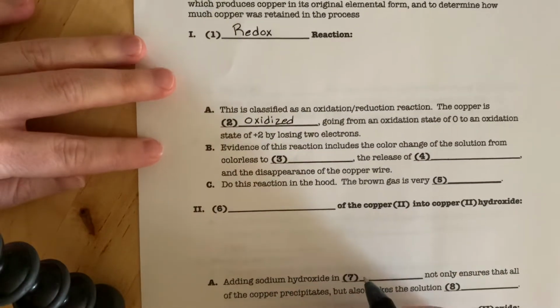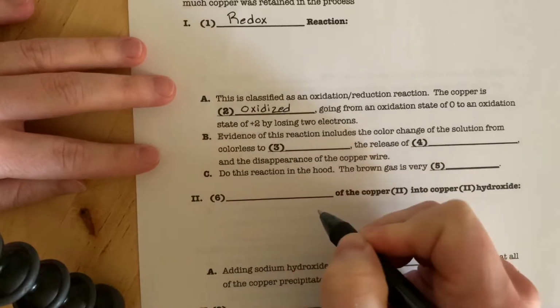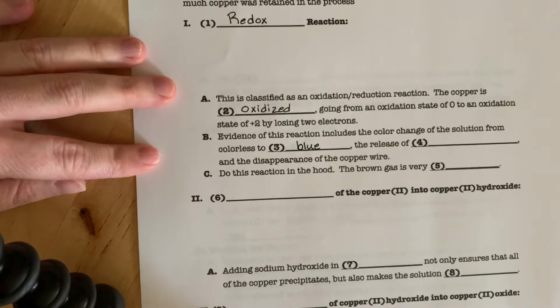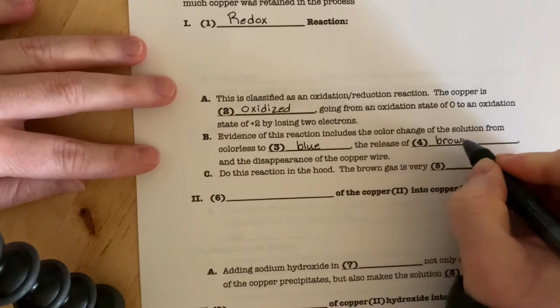It lost 2 electrons. So then you can see you'll have a clear and colorless solution at first, and then you'll get some blue, and that is the copper 2+ in solution. You will also observe some brown gas.